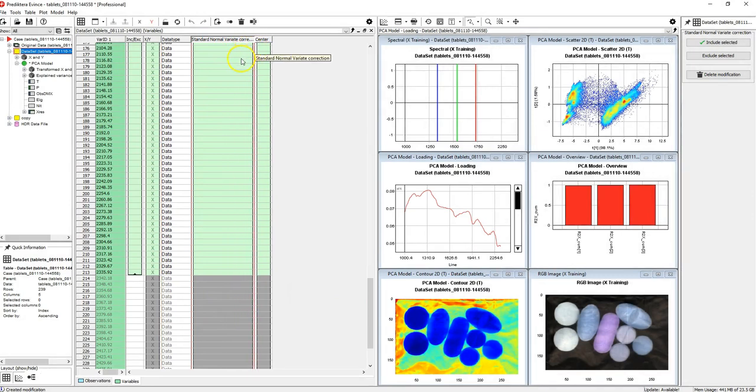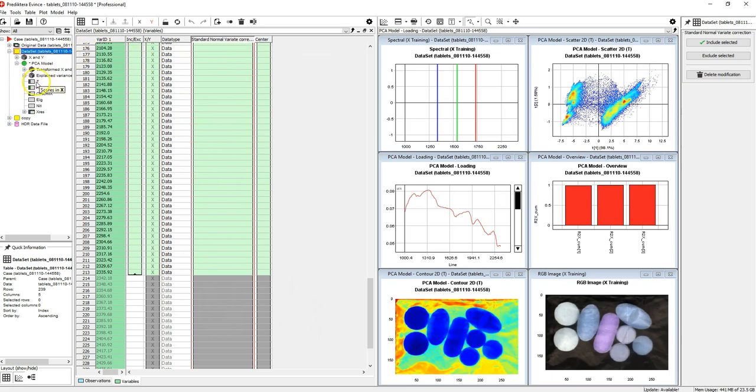If you want to look at specific data as a table, simply drag and drop from the data tree to the table area.